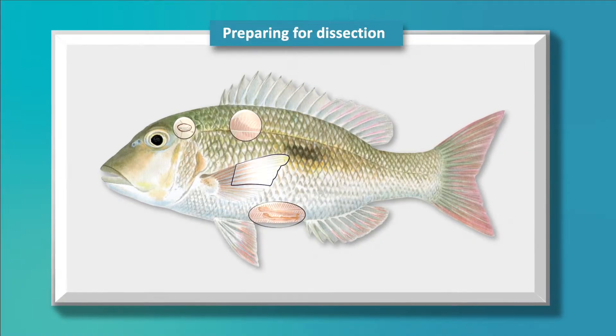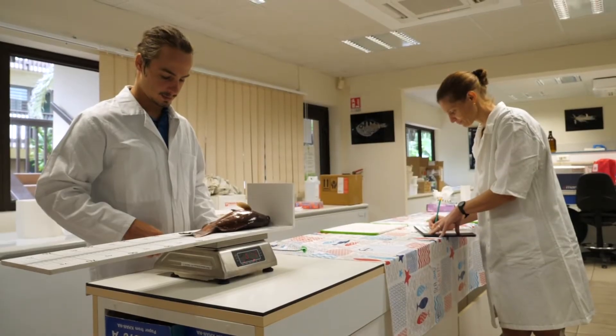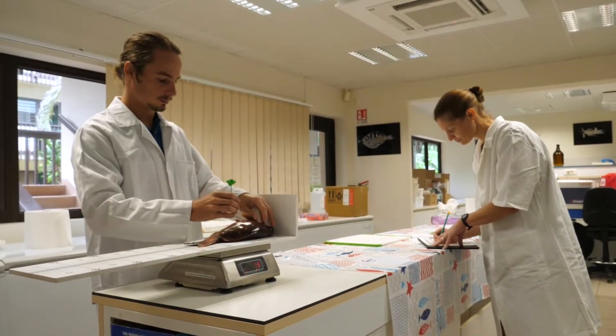Preparing for dissection. Before starting the dissection, you will first measure, weigh, and assign an identification tag to the fish to be dissected.